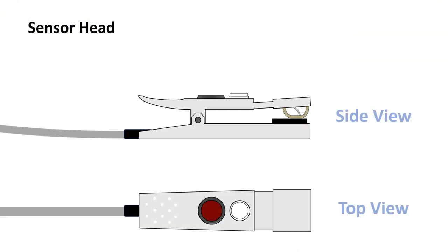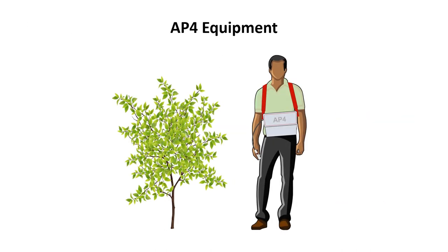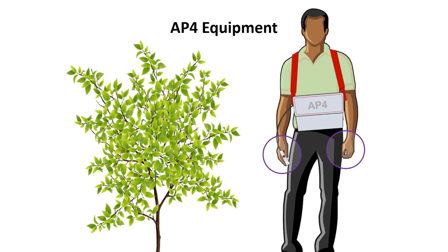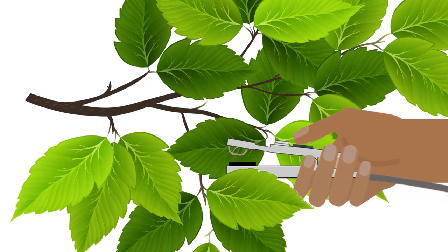On the upper surface of the sensor head lies the main control button and a small light sensor used to assess light conditions at the time of measurement. The AP4 body straps comfortably to the user, freeing up their hands to position and operate the sensor head amongst leaves.